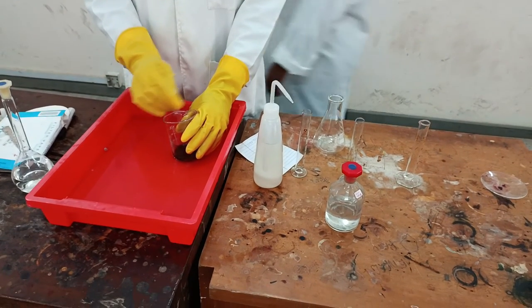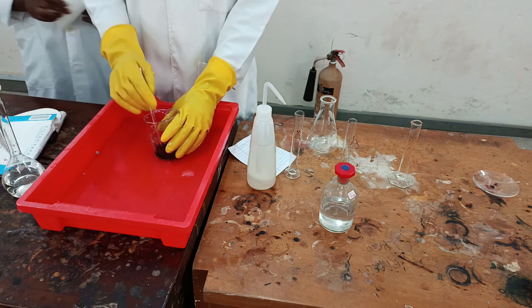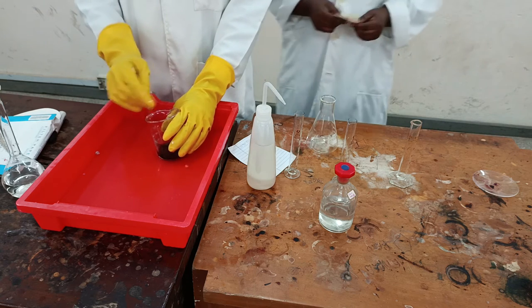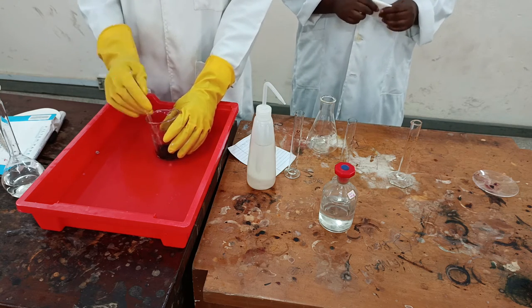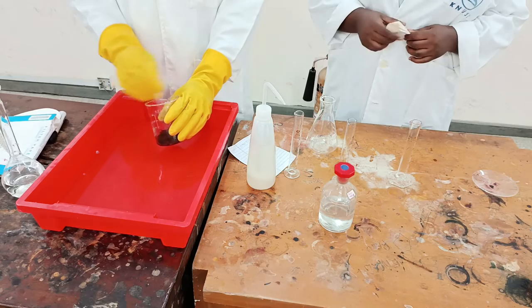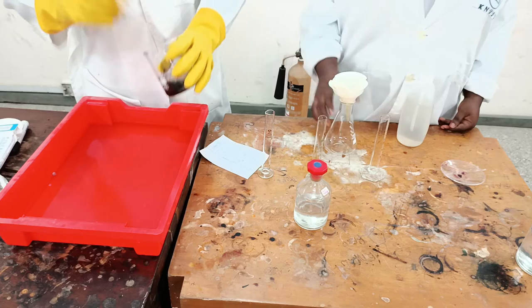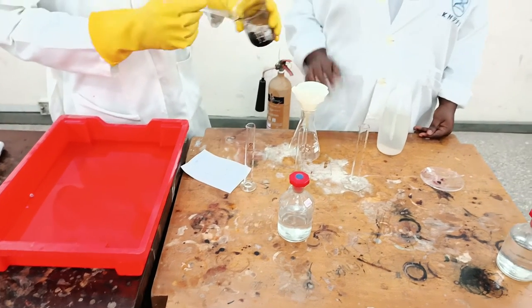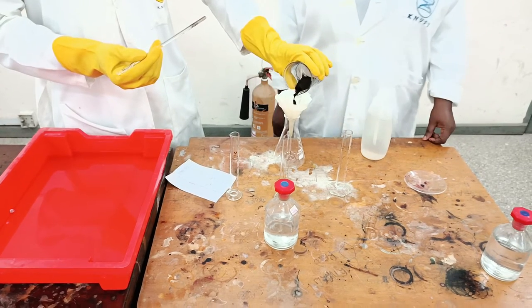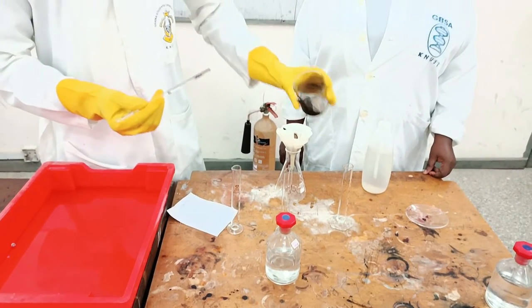Then heat the residue again in dilute HCl, and here we are using 0.5. My lab technician is holding the filter paper for the filtration process. Now we are doing the filtration. Our product crystals are mixed with the activated charcoal.